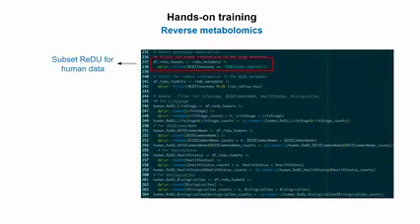and humans. And then the second step that we were interested in is to find out if those molecules are associated with specific diseases. This is what we care about when we discover those types of new molecules in different biological contexts, or if we have different modifications of a drug, for example, right? Maybe this drug was supposed to target a specific location, but then it gets modified by microbes, and then it reaches another location, so you have off-targets, right? So these are all the types of analysis that you can do.